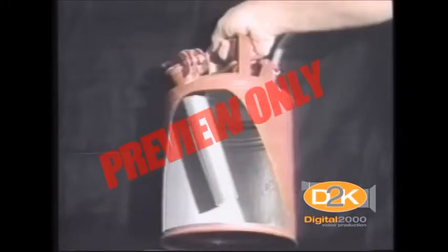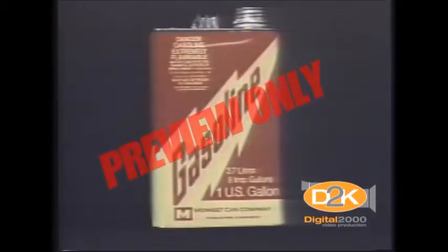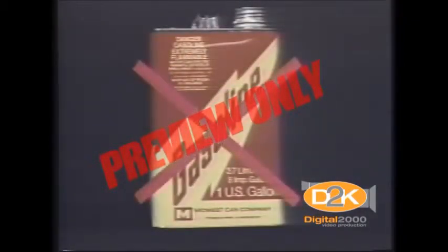Another part of an approved safety container is the flame arrestor. It looks like a metal filter. This flame arrestor prevents a flame from entering the can, should the vapors or liquid catch on fire. The non-approved safety cans don't have flame arrestors, therefore they can be extremely hazardous.